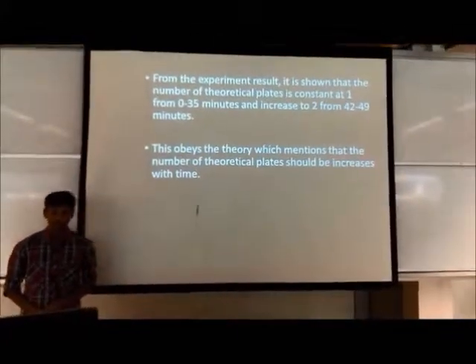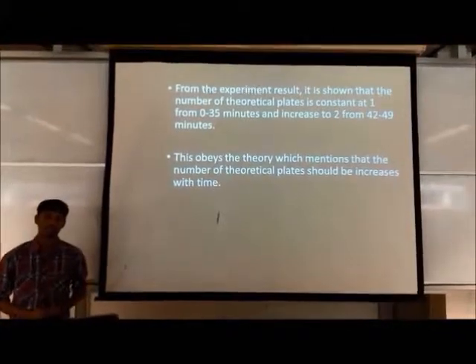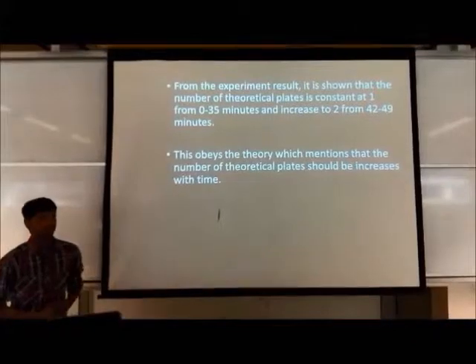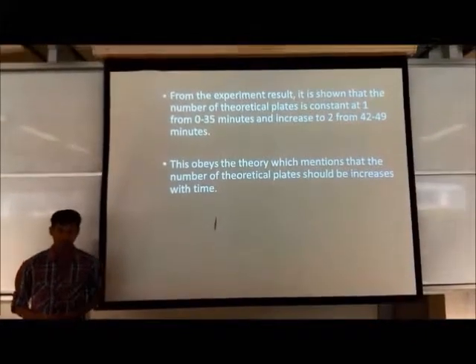From the experiment result, it is shown that the number of theoretical plates is constant at 1 from 0 to 35 minutes, and it increases to 2 from 42 to 49 minutes. This obeys the theory that the number of theoretical plates should increase with time.